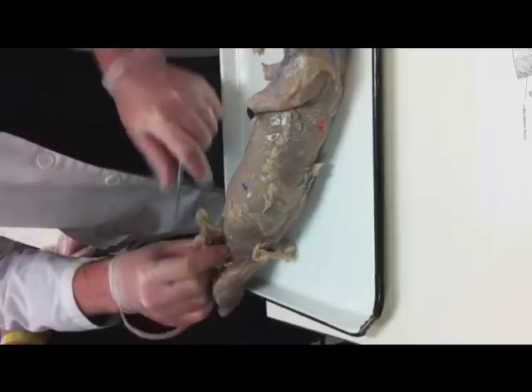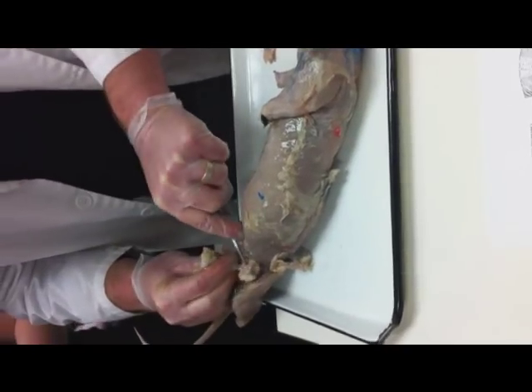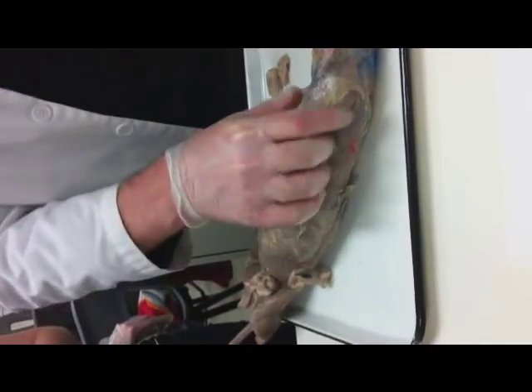All right, so that's genitalia there. And this is fat surrounding the genitalia, so I'm just going to remove that. Ouch. Now, that's the kind of stuff we don't want in the drain. That's the stuff we want in the garbage.